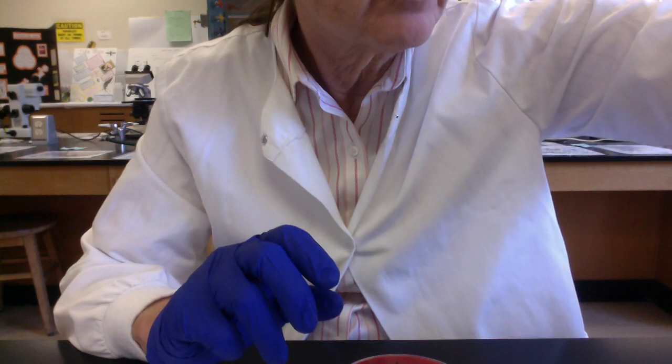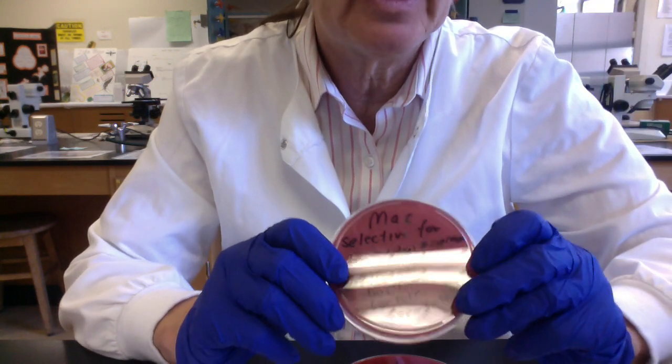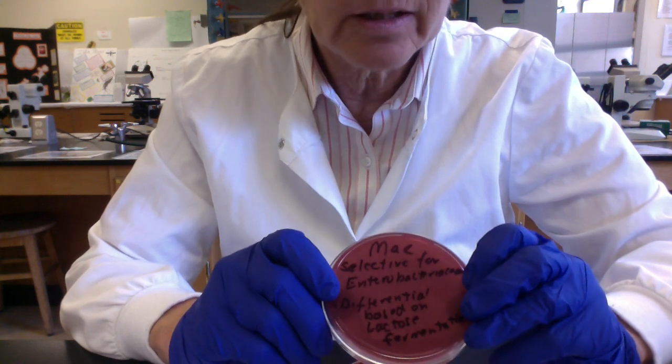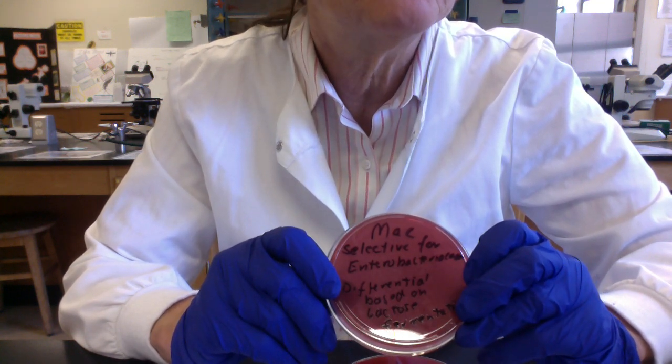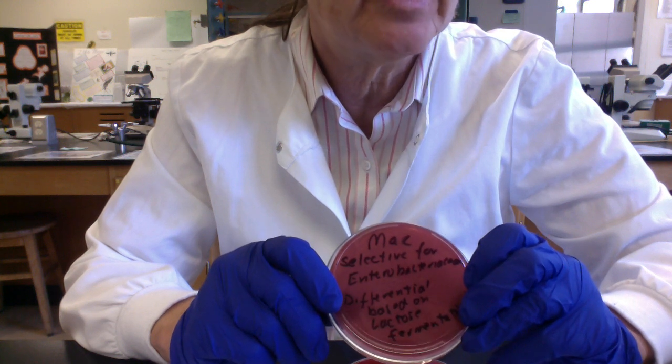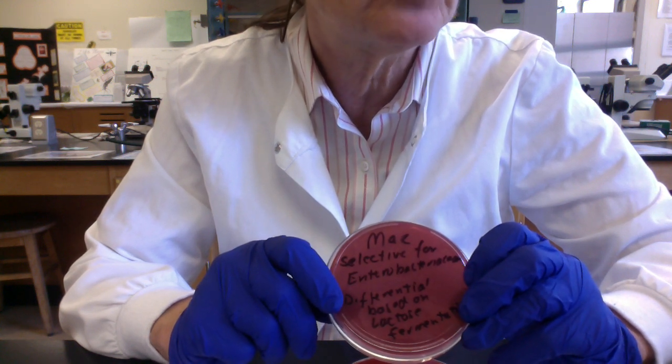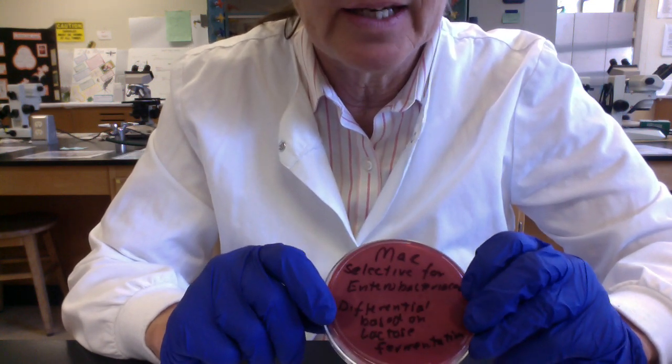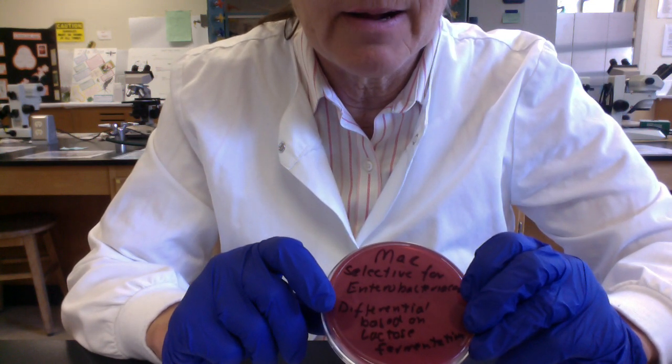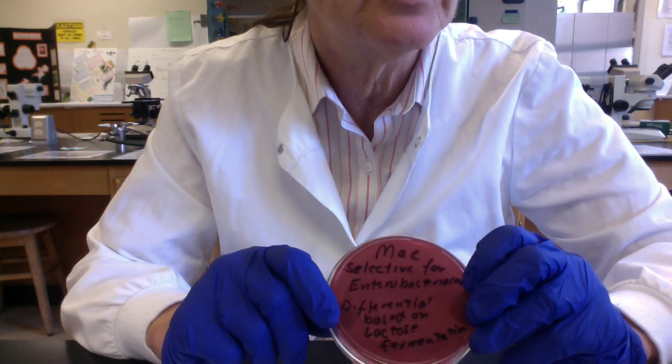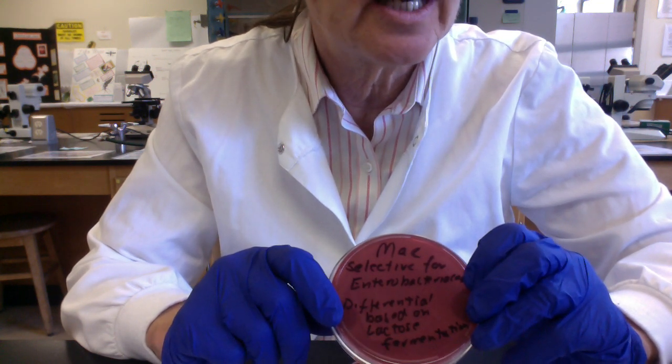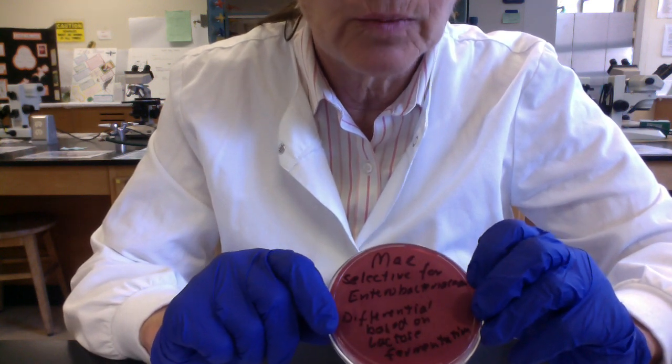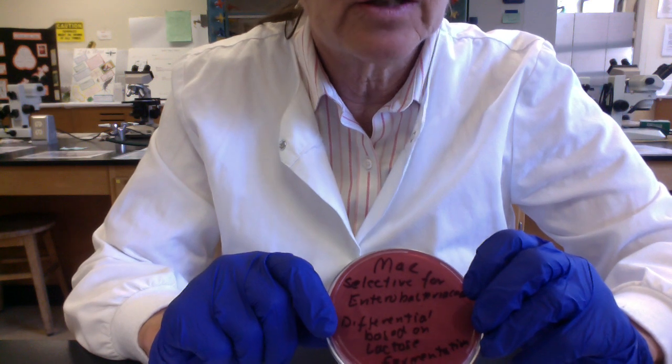The last plate we have here is an example of both a selective and differential medium. This is called MacConkey's agar. It selects for gram-negative Enterobacteriaceae. These are gram-negative bacteria that have evolved to live in the intestines, thus enterics. And then, in addition, it's differential. So the Enterobacteriaceae that can grow, we can group them according to their ability to ferment lactose. So MacConkey's is also differential based on lactose fermentation.